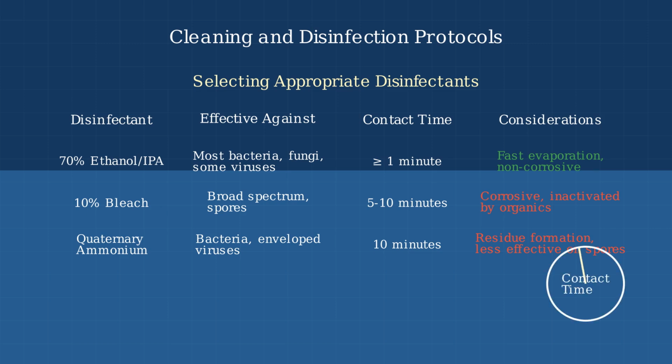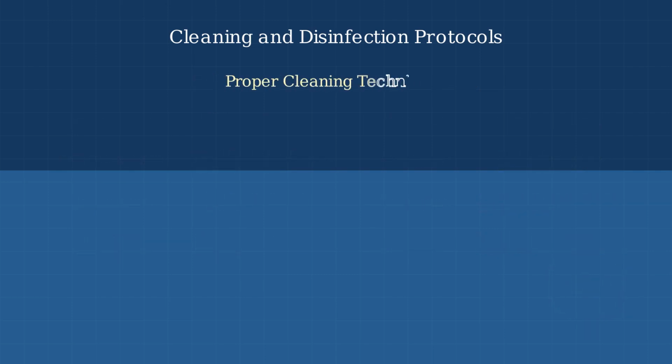Regardless of the disinfectant used, adequate contact time is essential for effectiveness. Many users prematurely wipe surfaces dry, reducing disinfection efficacy. Using proper cleaning techniques is essential to maintain cabinet function and prevent cross-contamination.